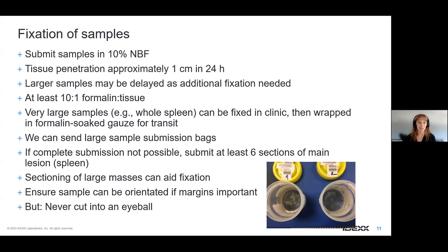Also important for the spleen and some larger skin masses, for example, I just had a case this week, actually. It was a large mass from the prepuce area. And obviously in that area, scrotum, prepuce, the skin is really thick. So in these cases, it can actually help to just slice into the section. Don't slice through it, but just slice into it. And that will allow for a better fixation.